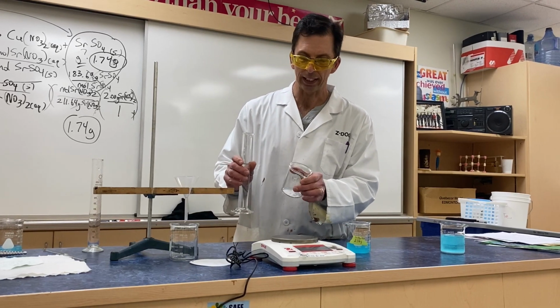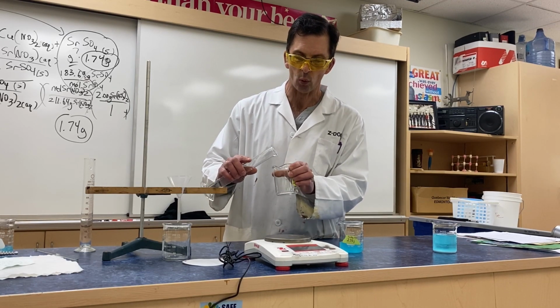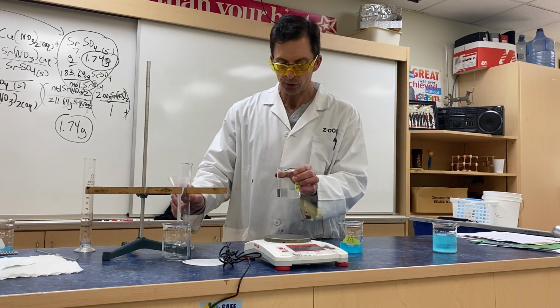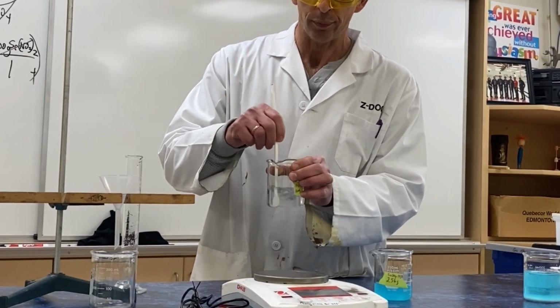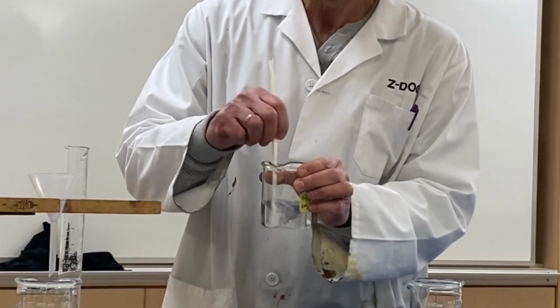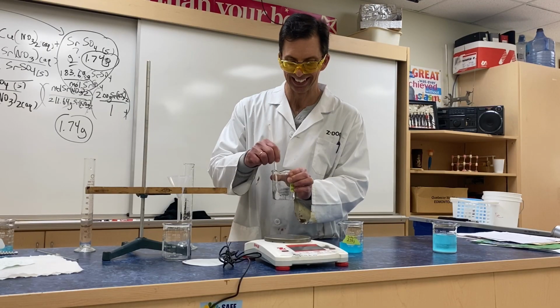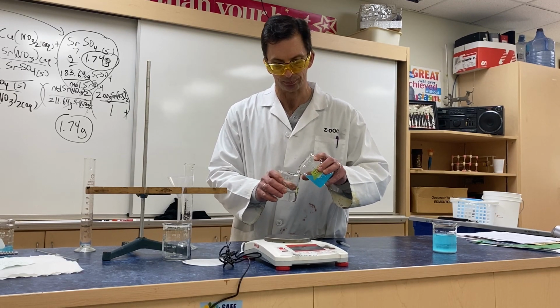Making electrolytes, making reactions. Similarly, I've got 2 grams of strontium nitrate. It's a white solute, as you can see. Our limiting reagent, all of it's going to get reacted away. Also combining that with 75 milliliters of distilled water, preparing the solution. That does not look as tasty as the other stuff. Raspberry Kool-Aid versus lemonade, baby. We react the 2 solutions together, pouring one into the other. Ooh.